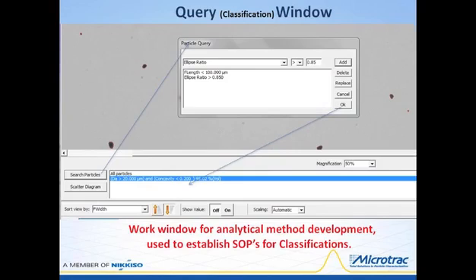Highlighted in blue above is a classification that was already previously entered in the list of choices. It's the equivalent diameter greater than 20 microns and concavity less than 0.2, which eliminates particles with a diameter less than 20 microns and particles that have a very smooth surface. The percent of particles included in the classification is listed also, 98% by volume in this case.